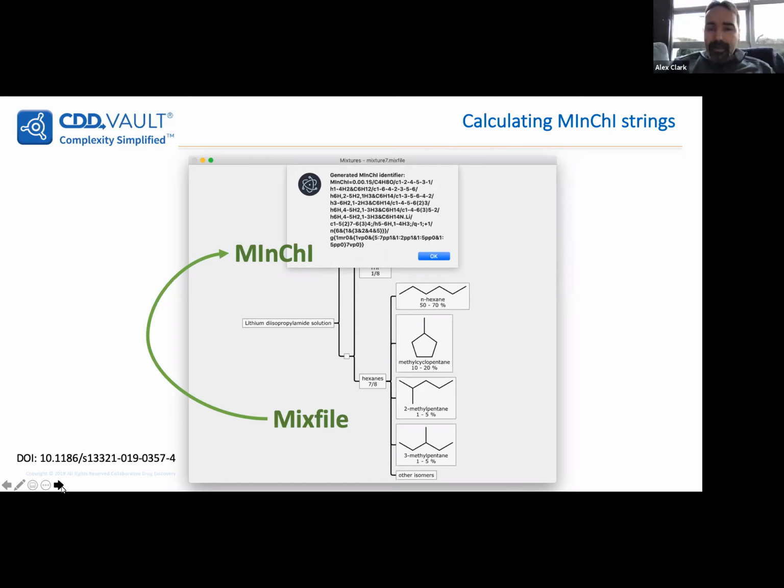I would again focus on this idea of starting with the vendors and going down through the steps. So this idea that you can find whatever it is that you need online and just keep that data throughout your entire workflow. And so that means you don't ever actually have to go to the trouble of describing these mixtures. If you just grab them from your internal inventory or wherever you found them online, that data just follows you around. And so we foresee a lot of ways to make things just so much easier.